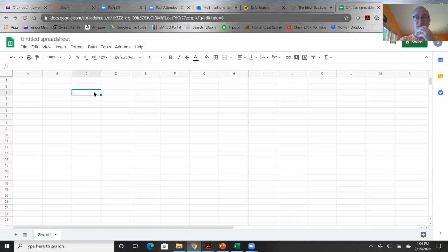All right, so we should have some information about the data we just collected. So we should have oxygen, and then give the pressure, P equals 220 millimeters of mercury, and the mass equals 200 milligrams. So that just tells us this particular set of data was collected under this particular circumstance.